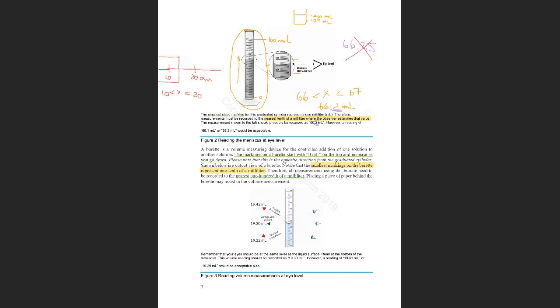In between these two numbers, I will say, well, here might be the half. It's a little less than half. So I would say that my value is 14 centimeters. I cannot add a decimal because I don't have more markings, and the 4 is the one I guess.